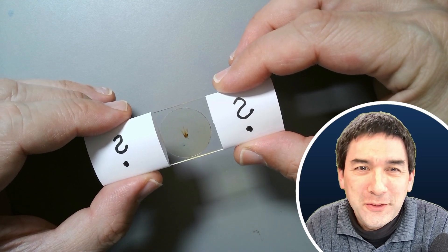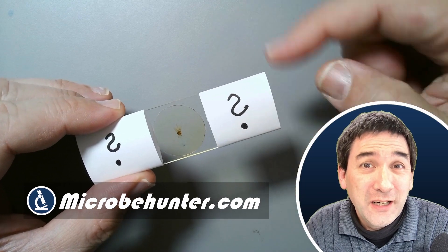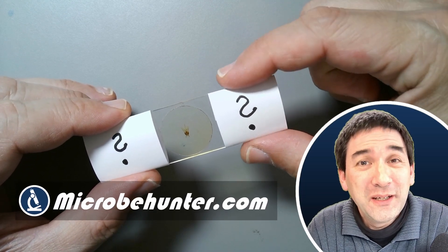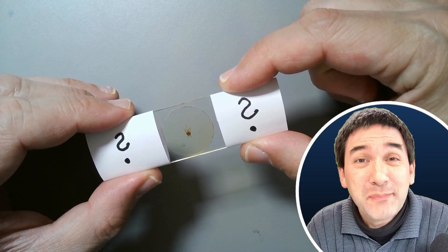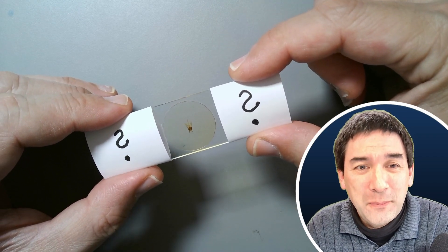Hello and welcome again, Microbe Hunter here. I brought another microscope slide today, but in this case I covered up the slide label because I would like to ask you to guess the specimen.